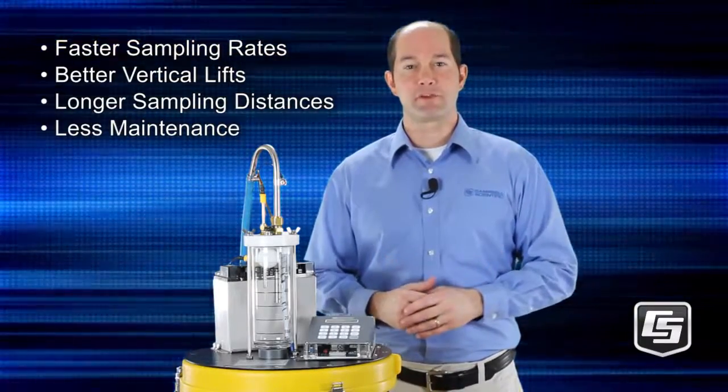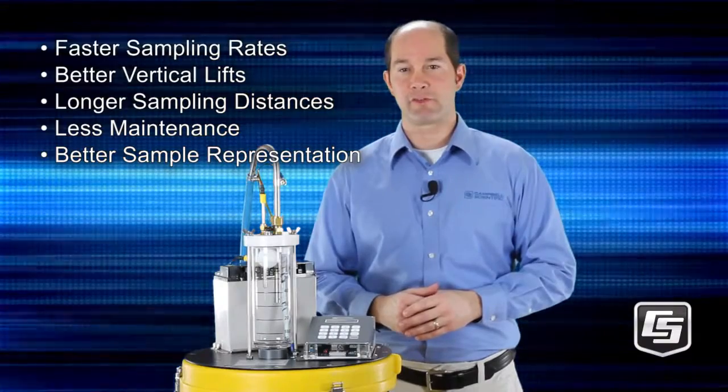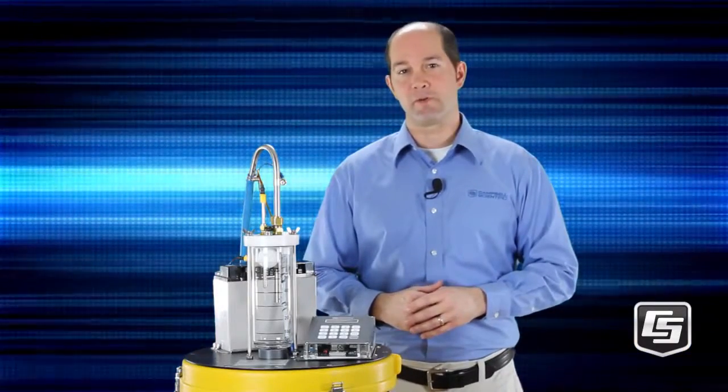Because the vacuum method disturbs water less, it better represents the original water solution, especially if the solution has high concentrations of suspended solids. I'm Colin Daly of Campbell Scientific in Logan, Utah. In this video, we'll show you how vacuum technology works in our water samplers.